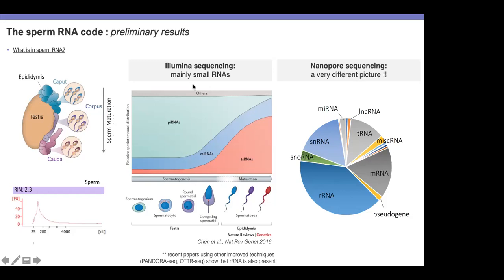One curiosity. Do these devices have a duration? Like the nanopore starts malfunctioning after X gigabases or something like that, like a car? So the question is whether nanopore devices die at some point. Probably the long story is yes, but then they just replace it, right? It will stop working like anything, I don't know, like if your centrifuge stopped working, right? What you change is a flow cell.